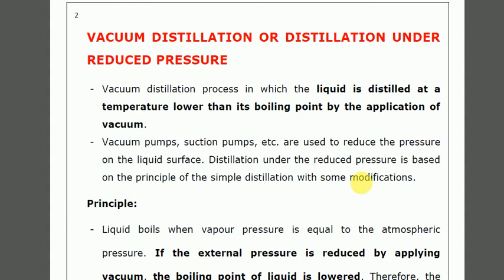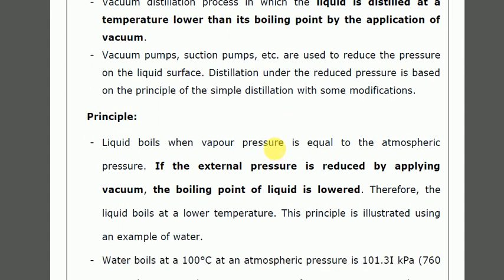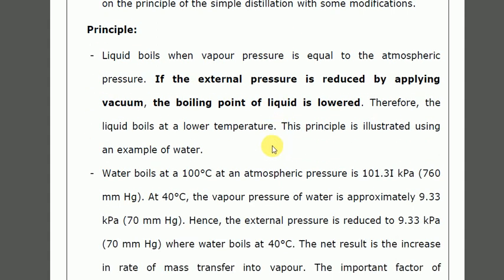Now, vacuum pumps, suction pumps, etc. are used to reduce the pressure on the surface of the liquid. Distillation under reduced pressure is based on the principle of simple distillation with some modifications. Now, what is the principle?